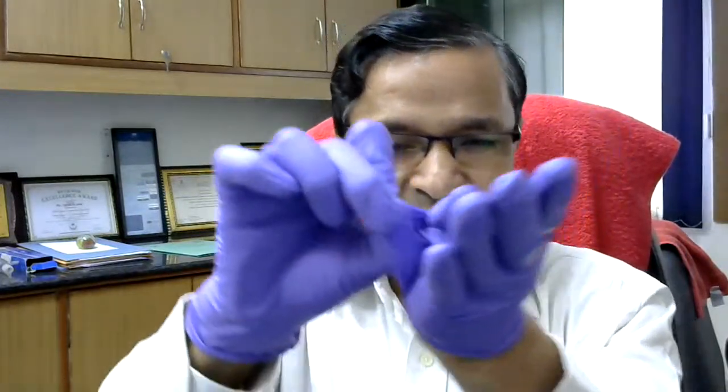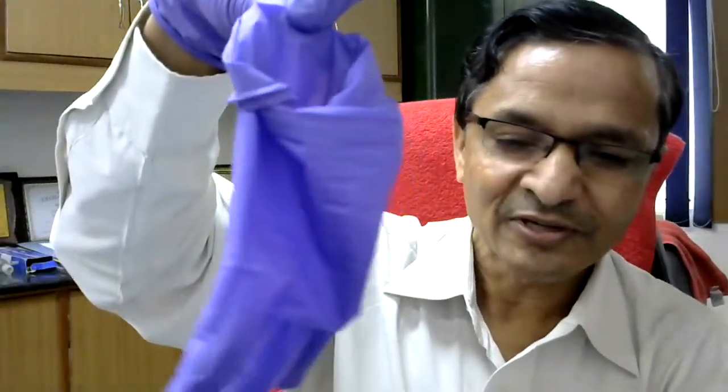I am trying to tell you that now I will show how to remove ethidium bromide contaminated gloves from your hand. Simply, you have to hold this one. You are not going to hold your skin, you are holding the gloves and you are removing like this. It has come out. Now, for example, below there is a dustbin, you drop it here, so that will go to the dustbin. Now you can see that my hand is not having gloves.